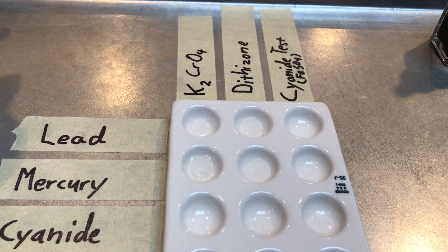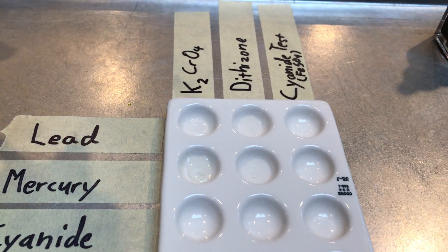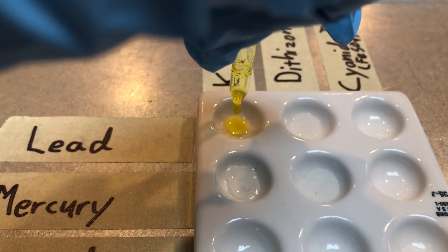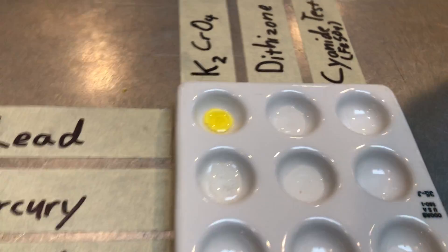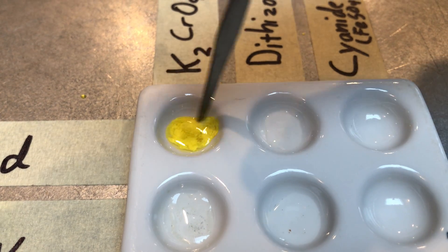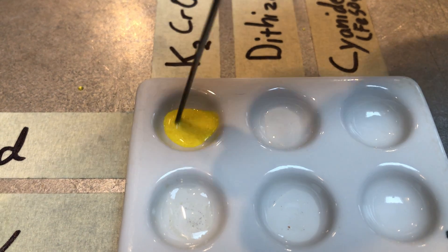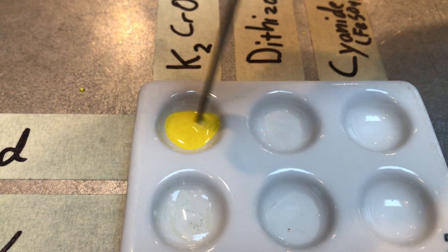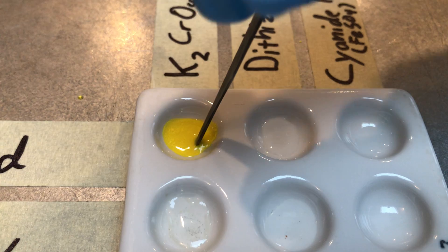James, please add two drops of the potassium chromate to the lead solution. So if you look, it turns this kind of yellow color, but you'll notice a solid starts to form. That solid is called a precipitate — it's when the actual metallic lead starts to precipitate out of the two combined liquids.